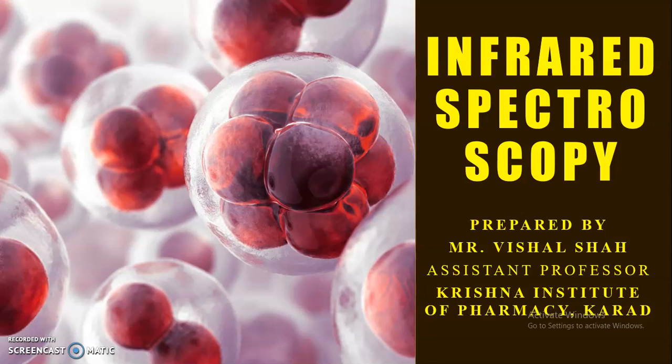In this video, we are going to discuss the basics and introduction involved in infrared spectroscopy. In the previous video, we started with some basics related to infrared spectroscopy. In this video, we are going to see what the infrared spectrum actually is. Also, we will see what the theory behind infrared spectroscopy is.